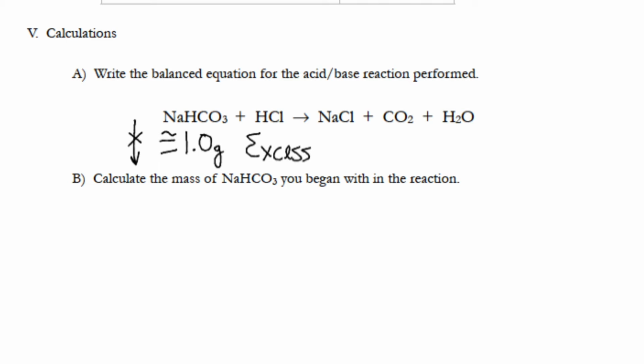Okay, so then guys, moving along, you understand that we're doing a percent yield thing, right? And so what that means is if we're going to do a percent yield, we need actual and we need theoretical. Let's talk about actual. Guys, in order to get actual, we actually need to weigh one of these products. So guys, picture it. Table salt, carbon dioxide, and water. So guys, when you're done with this reaction, what is your product going to look like?